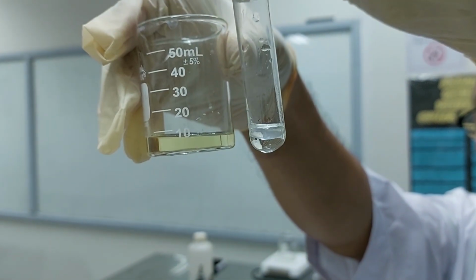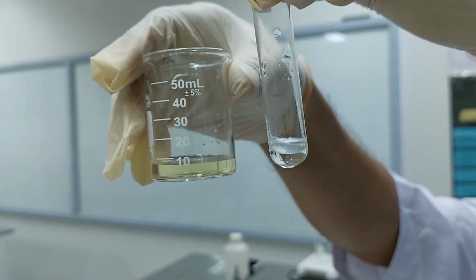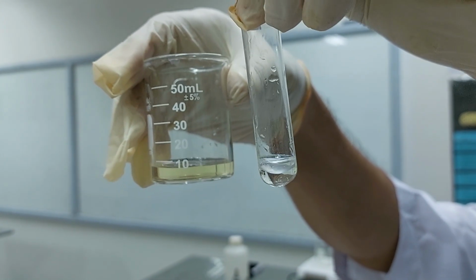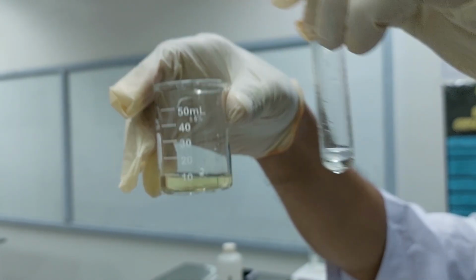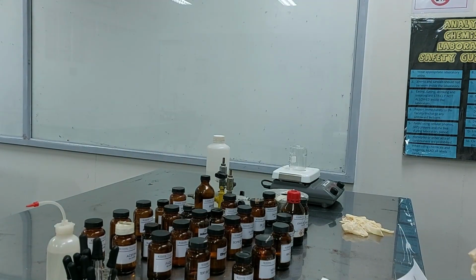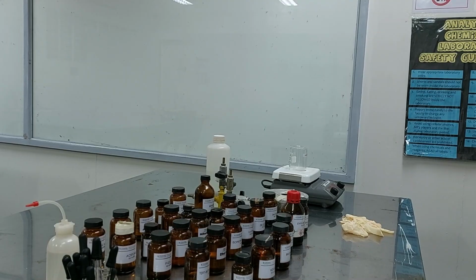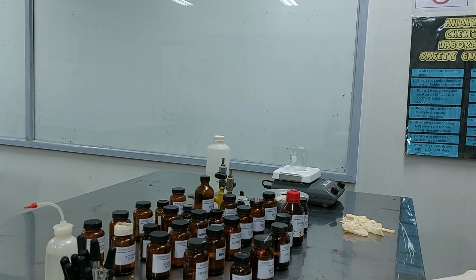But here you can still see a shade of yellow color for the benzene layer, indicating that it doesn't react with bromine.